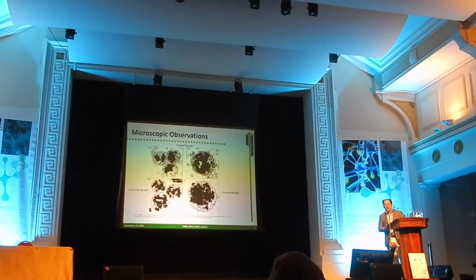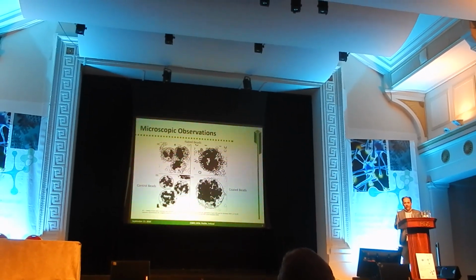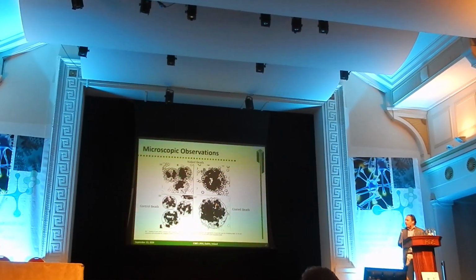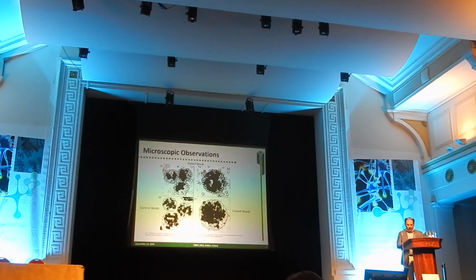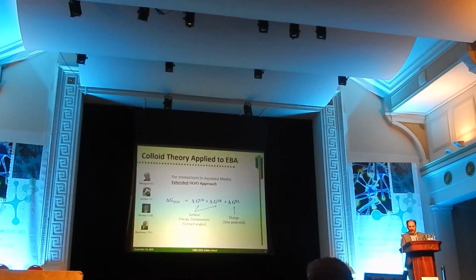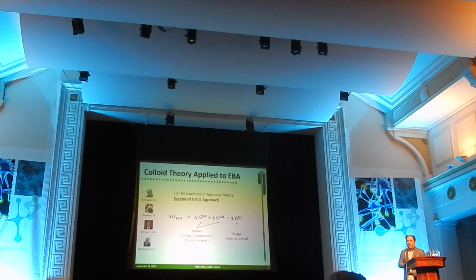So the question here became how we can look into this situation, how we can look at this microscopic or even nanoscopic level to see what is going on there. And our solution to this question was to implement a thermodynamic approach or principles of colloidal chemistry, so to say.